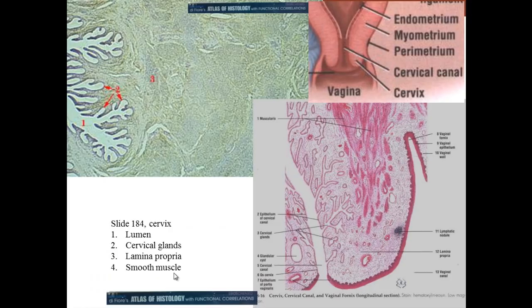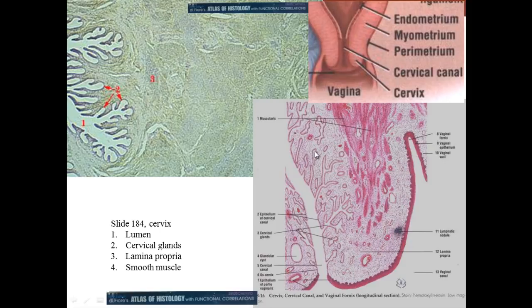We've just finished with the uterus and now we're going into the cervix. This is the uterus — remember the endometrium, myometrium, perimetrium — and then the endometrium gives rise to the opening to the cervix. The cervix has glands, and here we can see these glands that produce fluid to allow sperm to pass through at the time close to ovulation; otherwise it produces a barrier for bacteria.